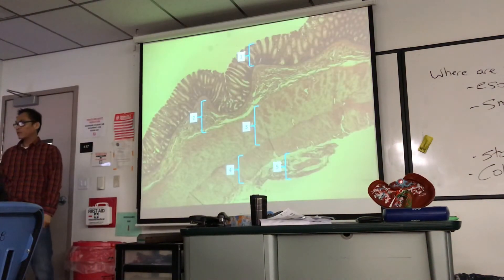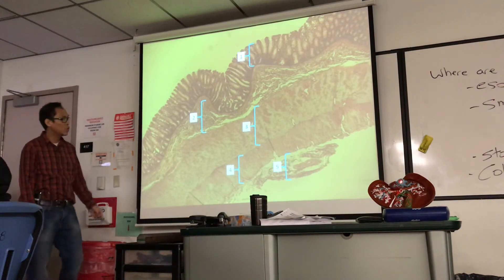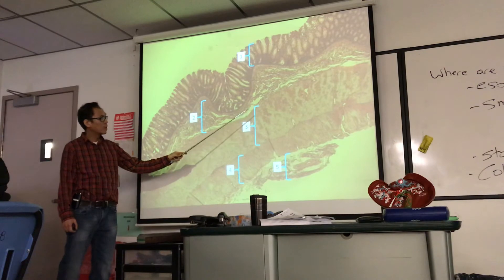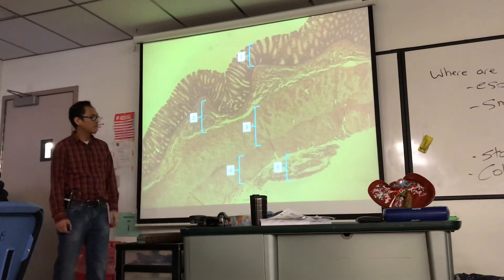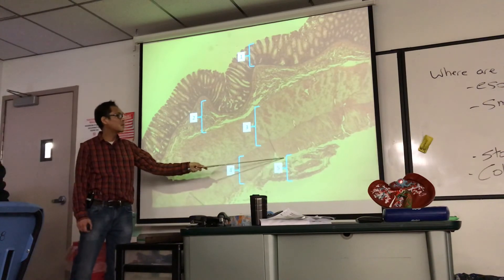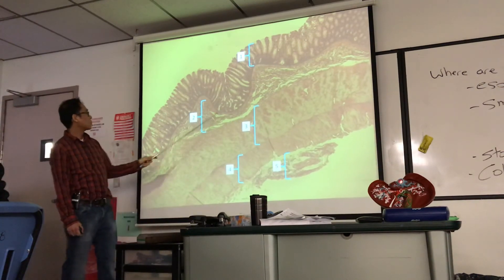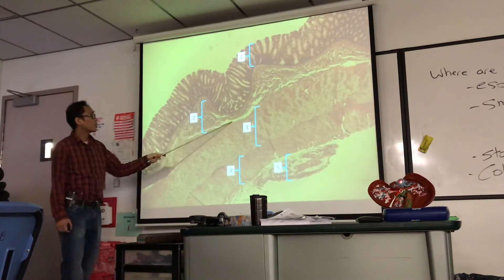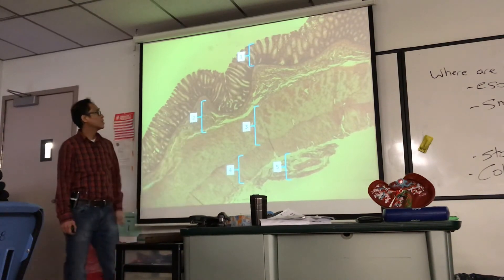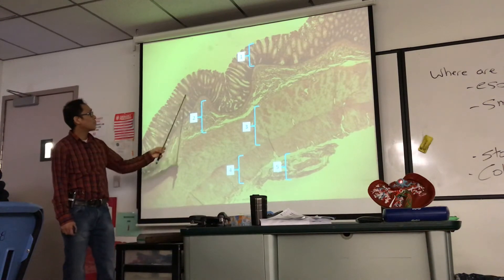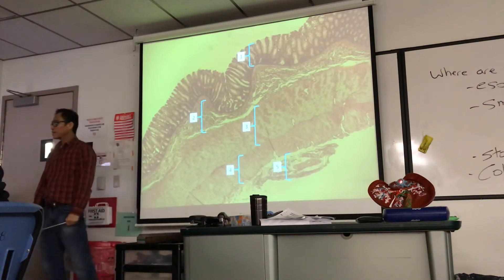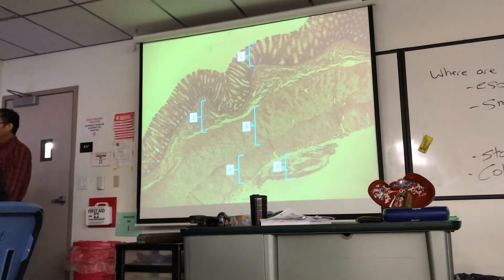Getting to colon. The colon has huge slabs of muscle — three and four: circular and longitudinal layers of muscularis externa. This is serosa/adventitia. From here to here is submucosa; therefore, number one is mucosa. Notice the structure — there are no villi here; it's these tight, tubular glands. And I want to emphasize the goblet cells.